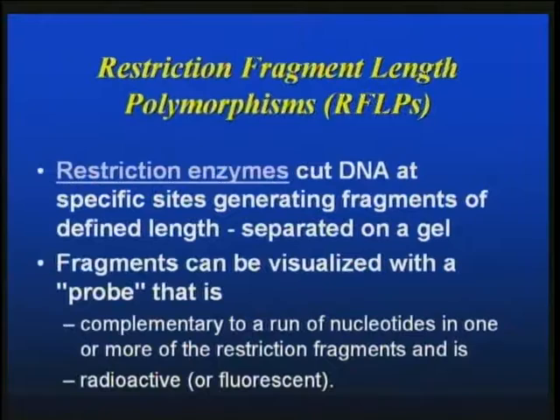So briefly to discuss restriction fragment length polymorphisms, which were first introduced by Sir Jeffreys in 1985, I think, and then was essentially the only DNA test in use for genomic DNA for at least until the mid-90s. And it's a crude assay. It's got a few caveats associated with it. But at the time, it was state of the art.